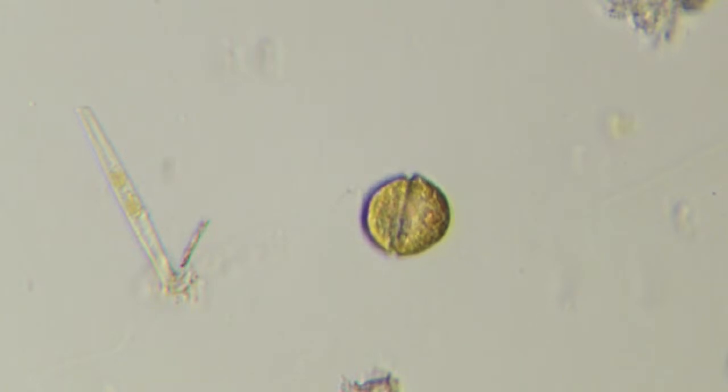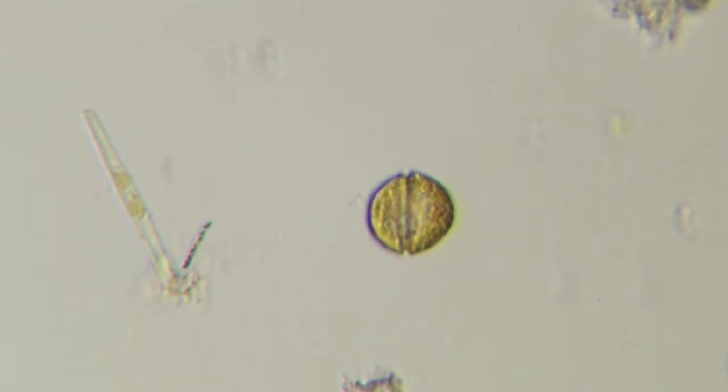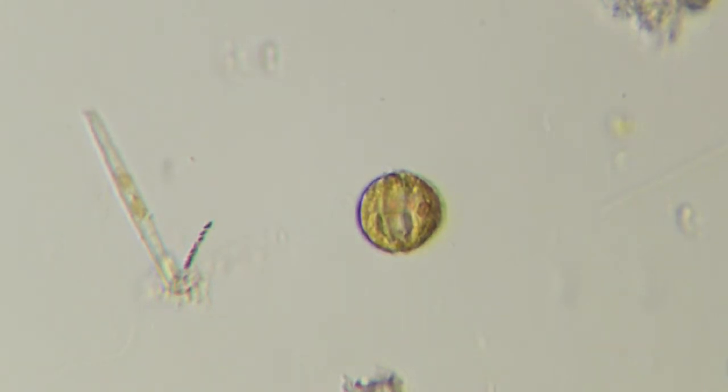But there, yeah, see as it rotates, it's like a ball with a little constriction around the center, and its flagella in there floating around. So you get that 3D structure to it. Almost like a little spaceship. Very nice. That also is probably a good excuse to go oil. I don't really have any shots of these guys that I liked. Let's see if I have any oil left in here.